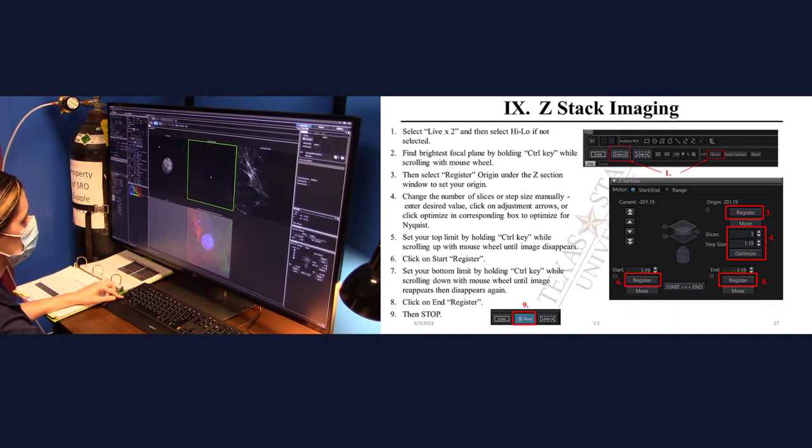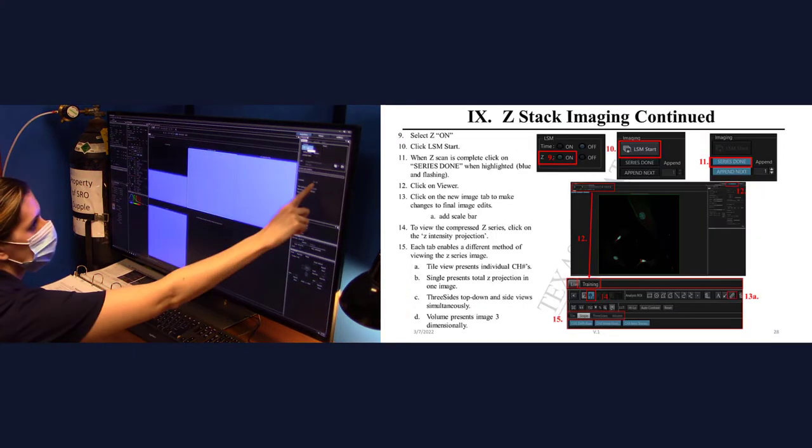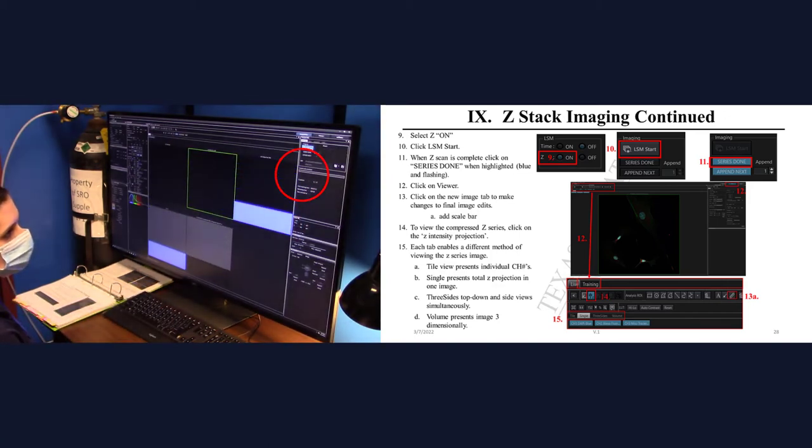Set your top limit by holding the Control key while scrolling up with the mouse wheel until the image disappears. Click on Start Register. Next, set the bottom limit by holding the Control key while scrolling down with the mouse wheel until the image reappears, then disappears again. Click on End Register. Select the Z On button and click LSM Start. The software displays how many slices are in your image and how much time the micrograph will take.